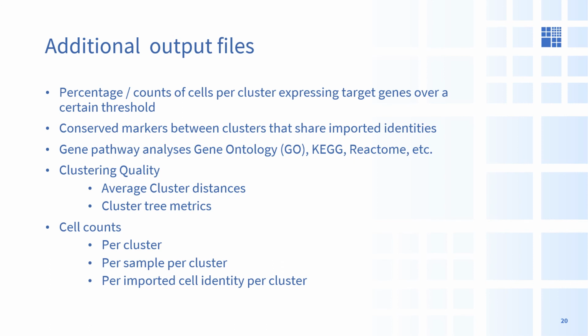In addition to all of these visual outputs and their corresponding data tables, we can also generate additional useful data table outputs, such as looking at not only what genes are differentially expressed, but what percentage of the total cells per cluster express that particular marker? This is especially crucial for cell line data and brain data sets that contain differentiating or highly diverse cell populations respectively.